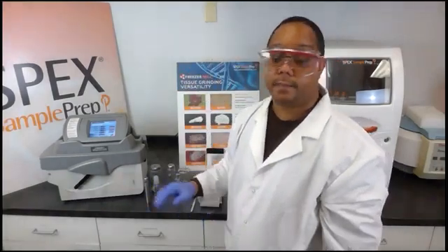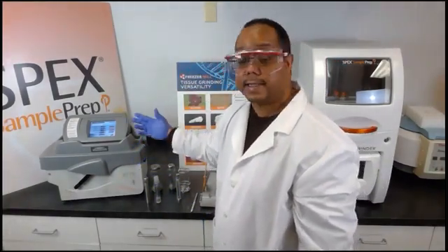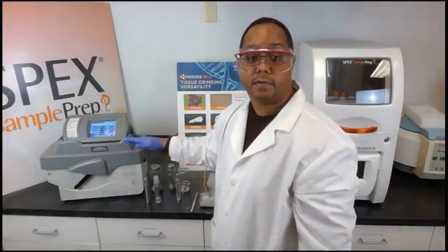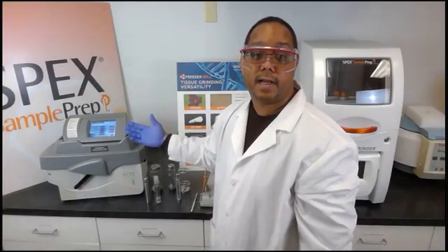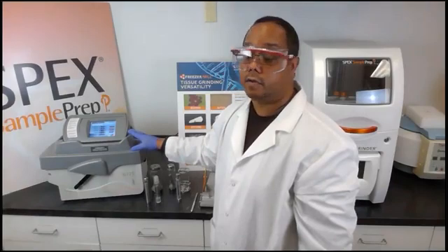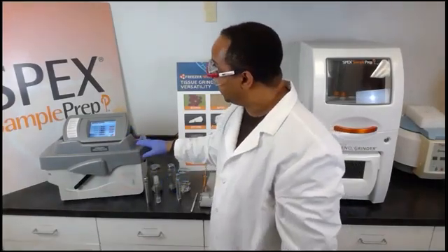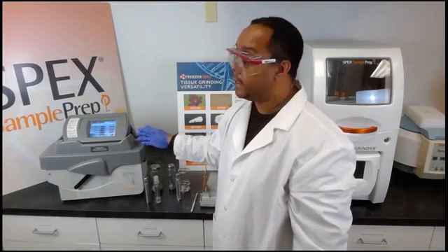With respect to time, we're not actually going to run the sample because it takes time for the sample to pre-cool, at least 10 minutes for the pre-cool, and multiple run times of 2 minutes, since the circuitry board is very difficult to grind. I prepared a before and after sample to show you what the results will look like.